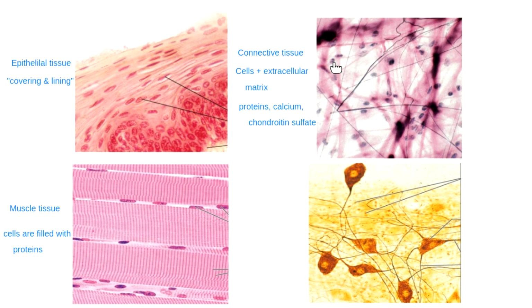But we'll see these cells that have a mixture of stuff on the outside. So in this picture, each of these little dots that I see right here are my cells. Those particular cells are called fibroblasts. Its name tells me what it does. It is a fiber builder, fibroblast.